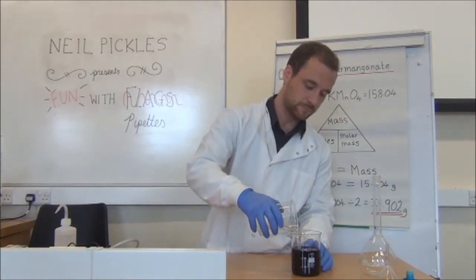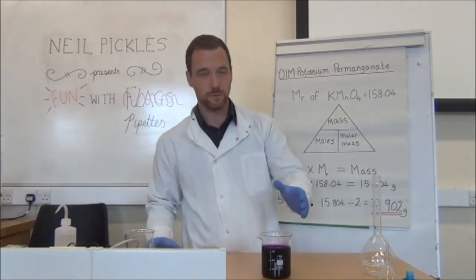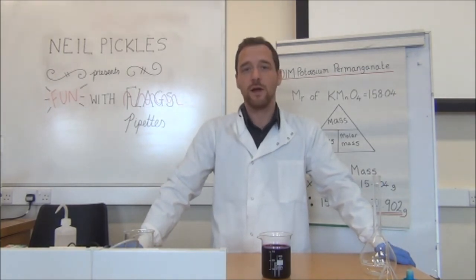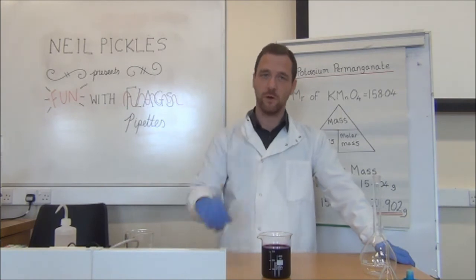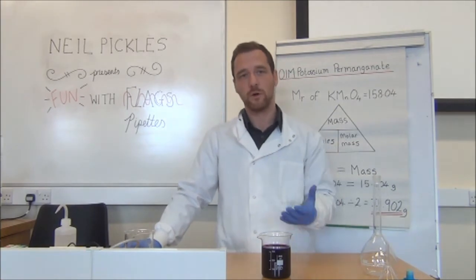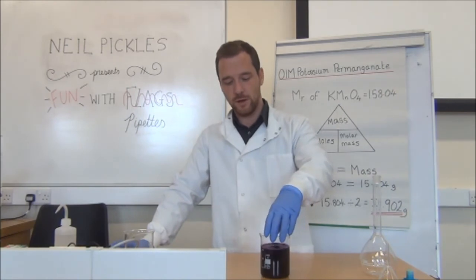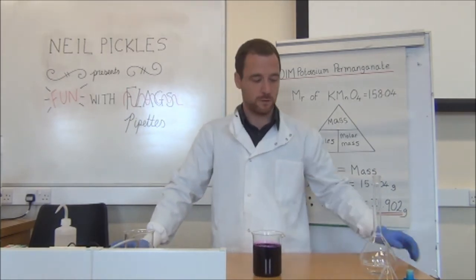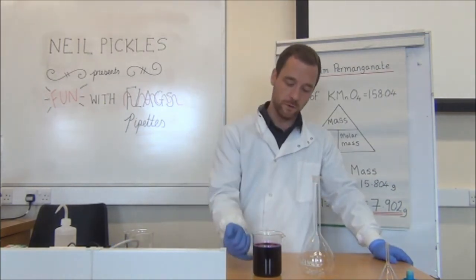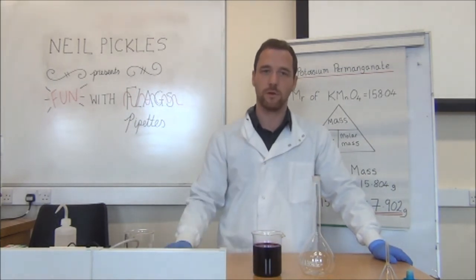Now this solution dissolves very easily for the purpose of the demonstration. However, your solution may need some time to dissolve, and a good indication of that is if you can see particles still in the solution, and so it may need to be stirred or put on a magnetic stirrer plate. But you can see that here it has dissolved, and now the important stage is to transfer into the volumetric flask. Also, by not using up the total volume, I can wash this beaker out and transfer into here.